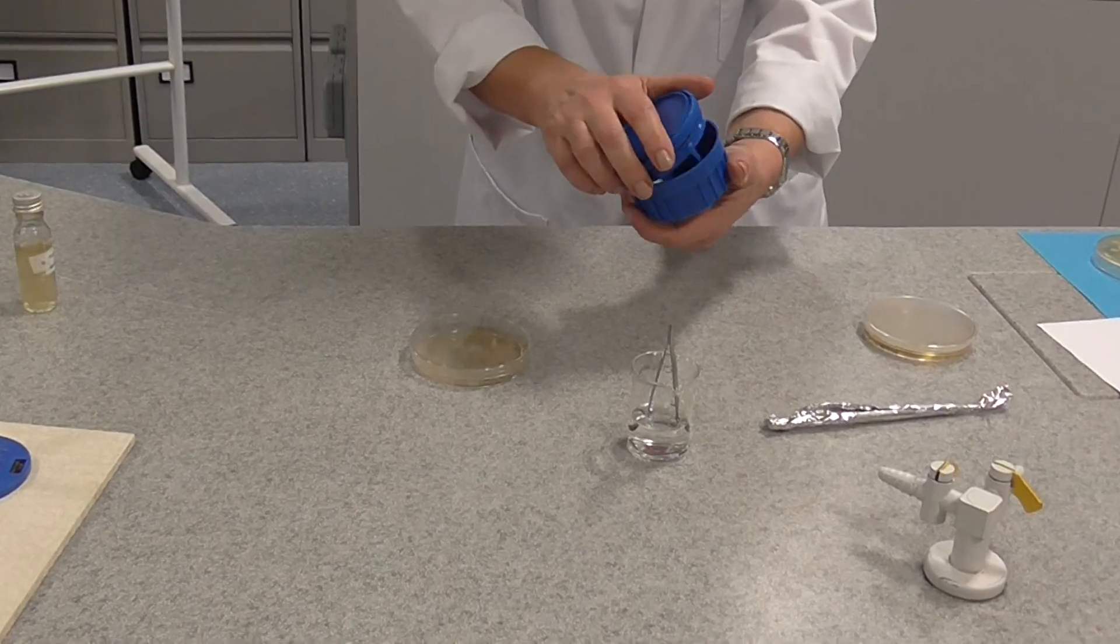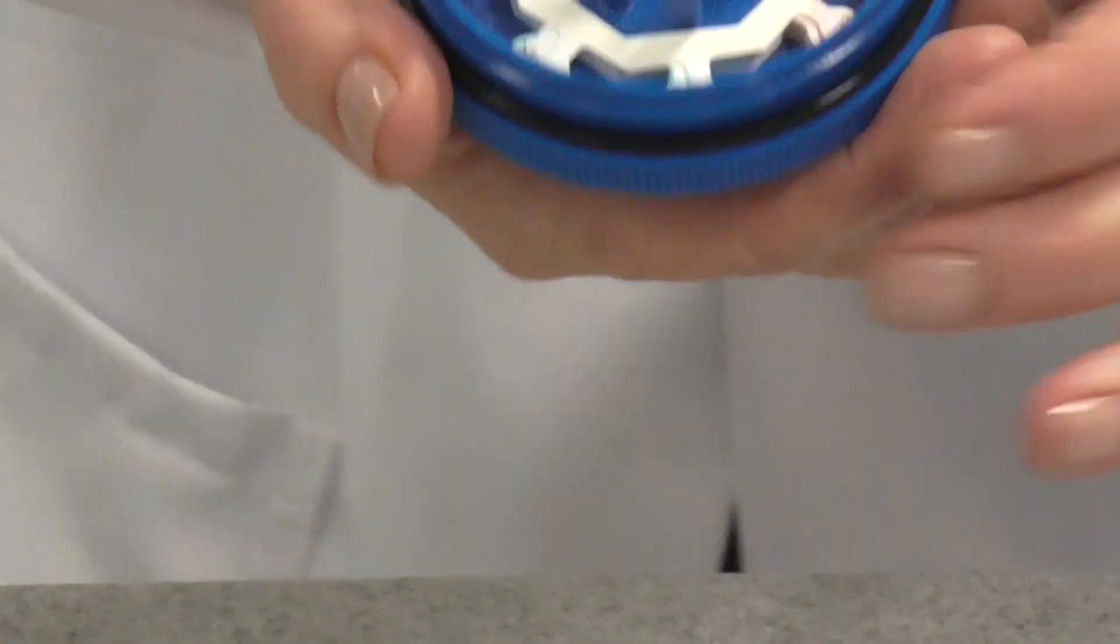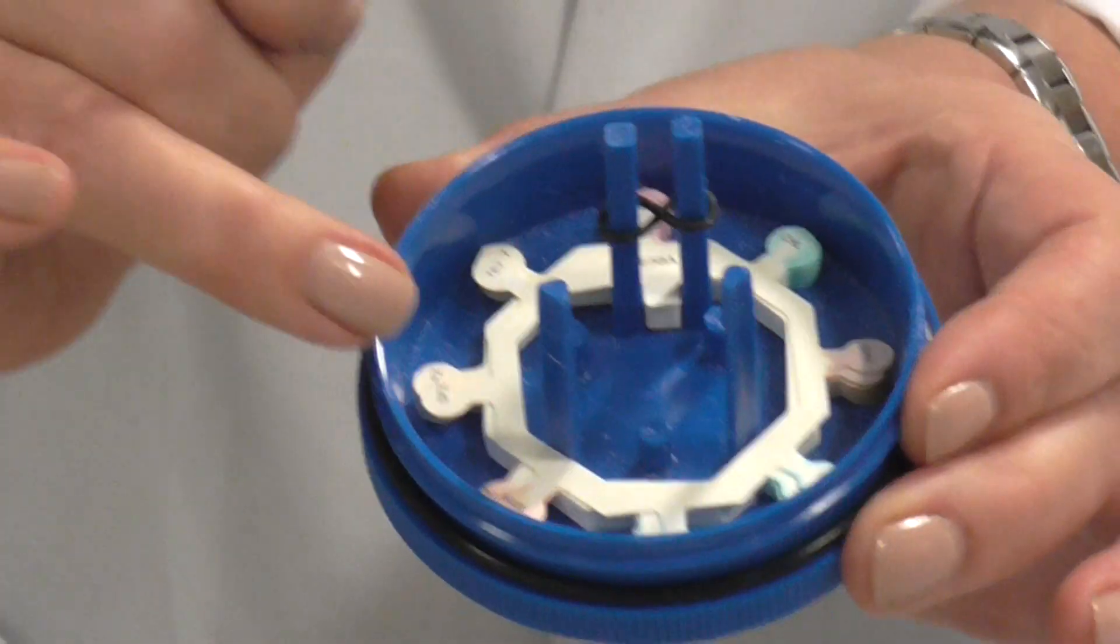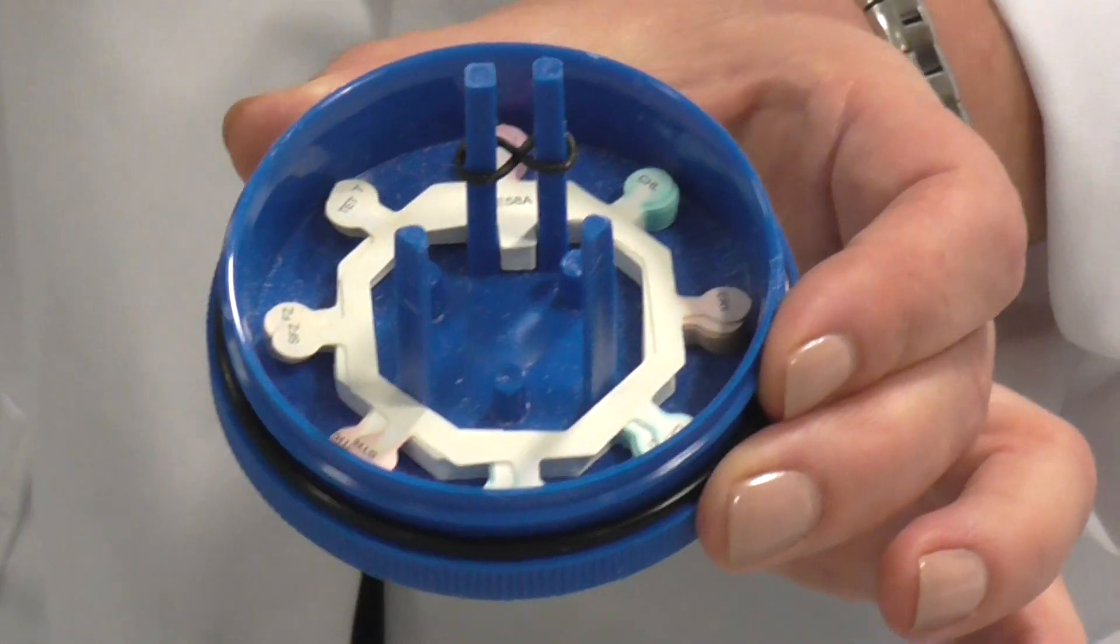And if you have a look here, this is what they look like. They arrive, and you can see it's actually a piece of kind of filter paper with little circles on, little discs. And each disc is impregnated with a different antibiotic.